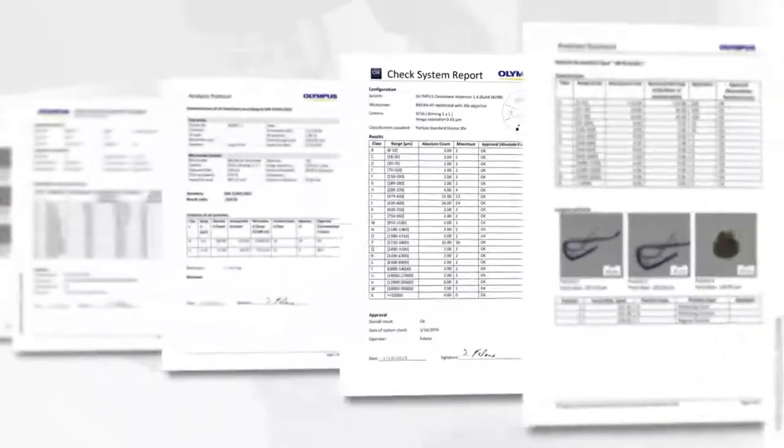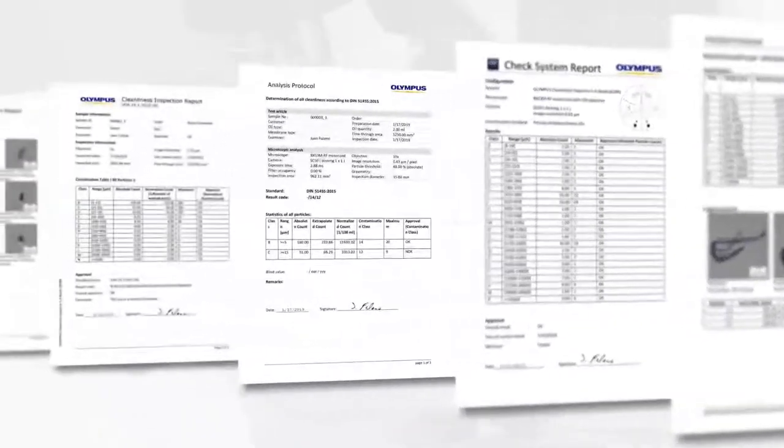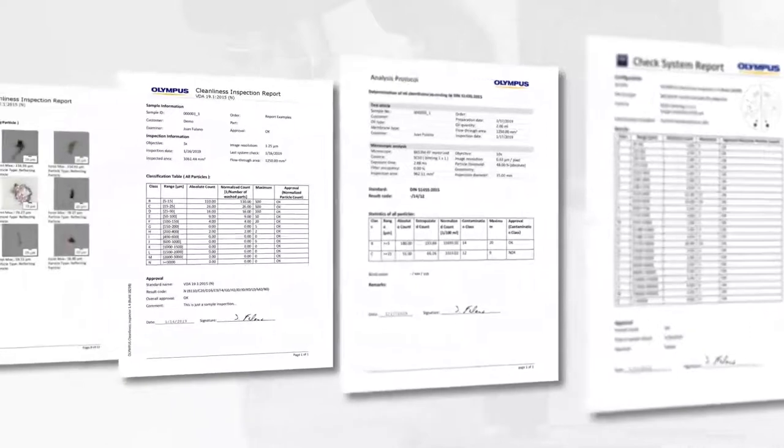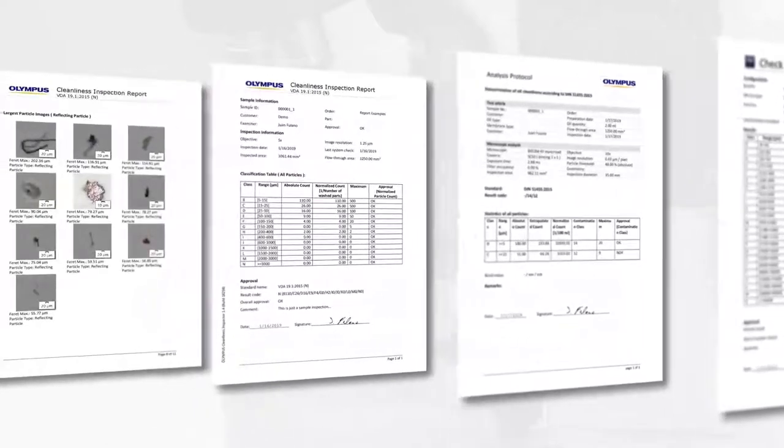The Olympus CIX100 system enables easy, one-click digital documentation of the inspection results.